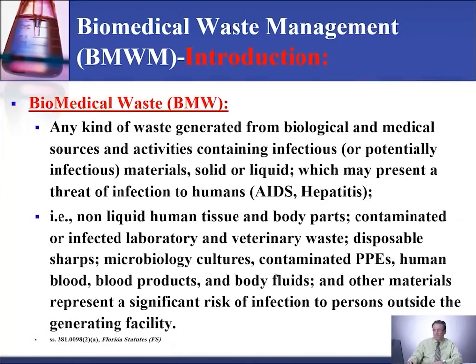Biomedical waste is any kind of waste generated from biological and medical sources and activities containing infectious or potentially infectious materials, whether solid or liquid, which may present a threat of infection to humans, like AIDS and hepatitis.